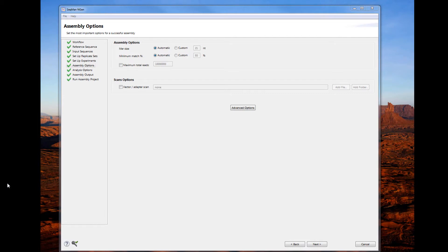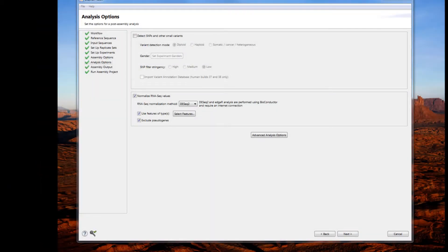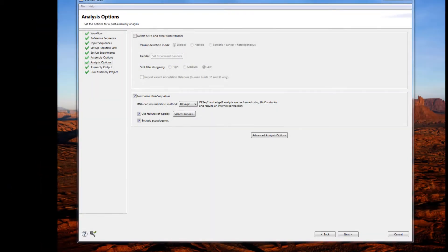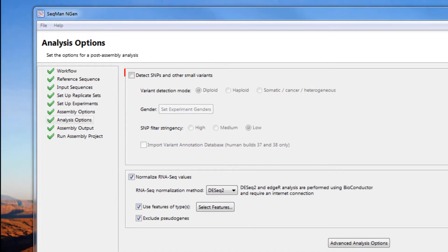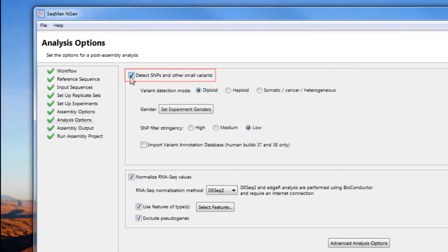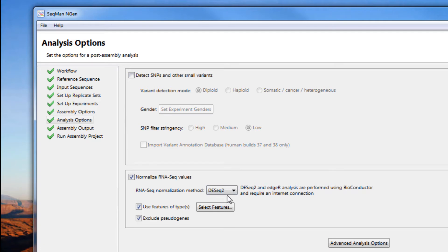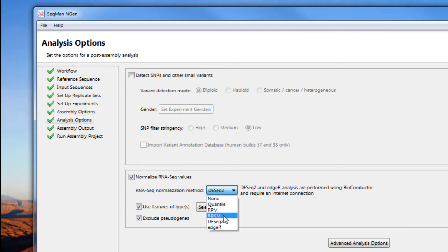In the Analysis Options page, you have the option to turn on or off variant detection by clicking the box here. In addition, you can change the normalization methods. SeqMan Engine suggests a normalization method based on your experiment setup, but you can choose to use any of the normalization methods listed.